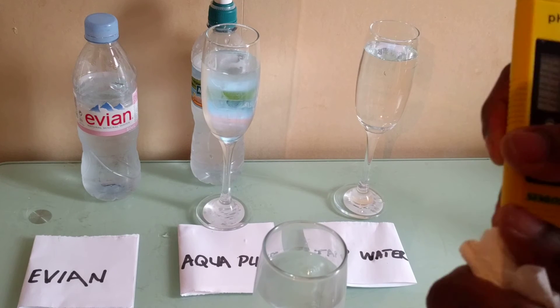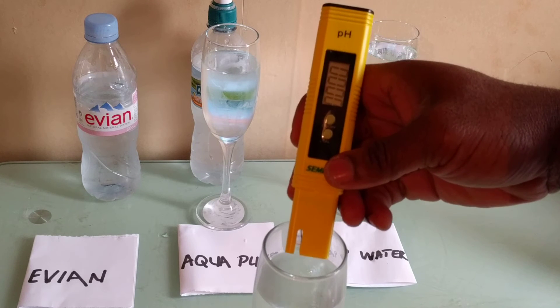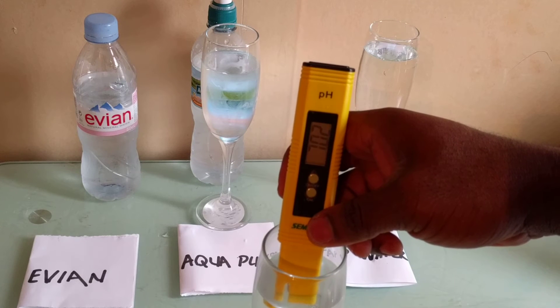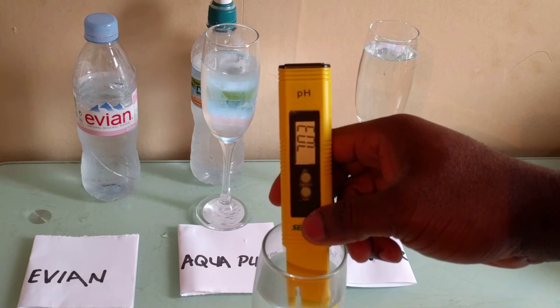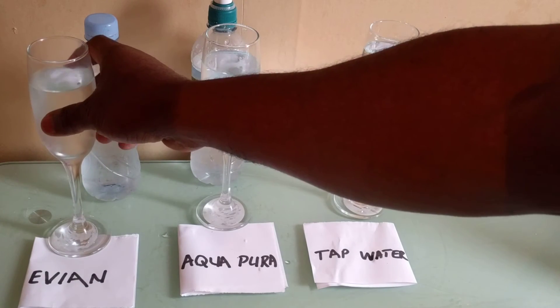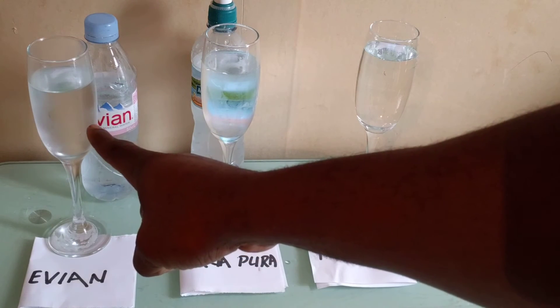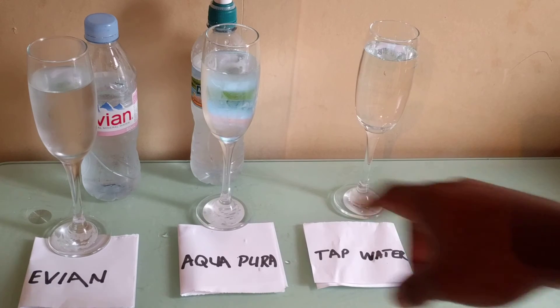Let's test the Effusion. Clean the probe here. And this one is at 7.02. So from this test we can see we've got a higher pH with the tap water, then the Effusion, and lastly the Aqua. Now the tap water is free — these two were purchased.